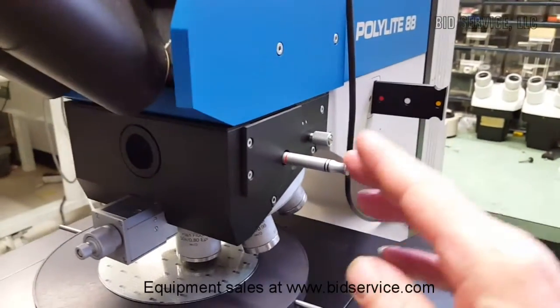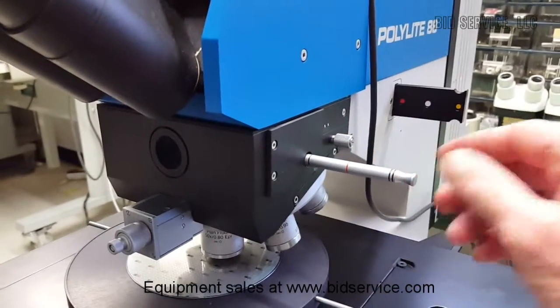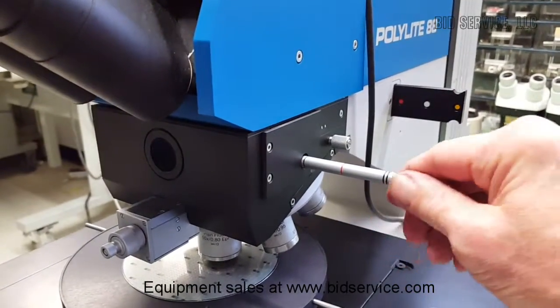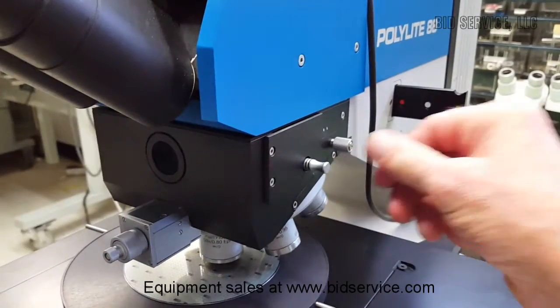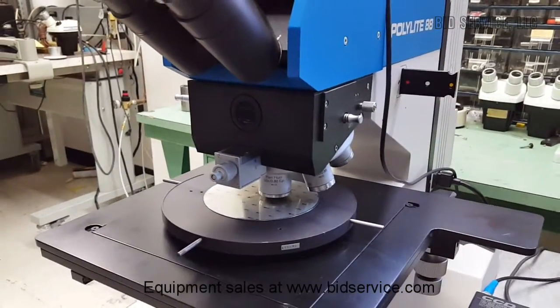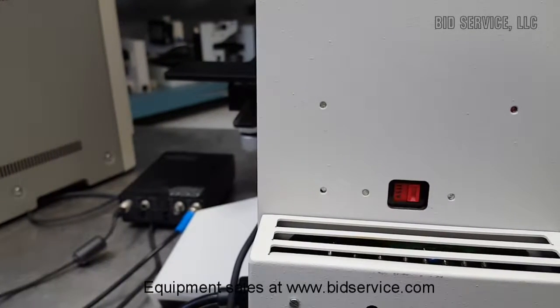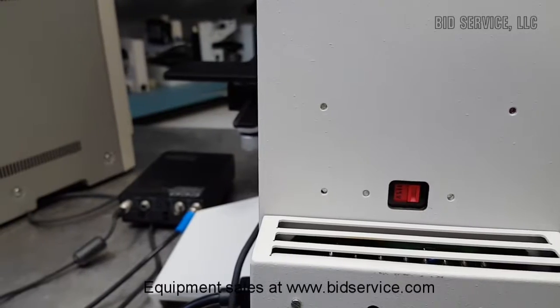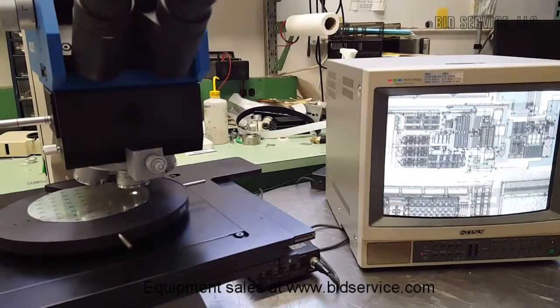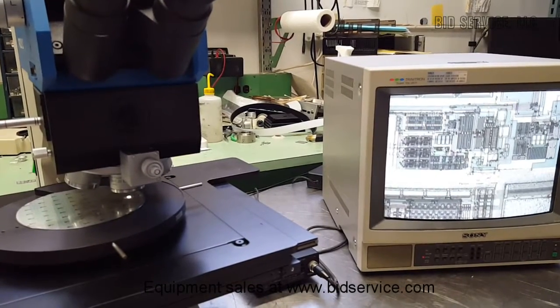Here's the other slide with dark field, bright field, and Nomarski options. On the rear there is a 115/230 volt switch. I'm going to move the stage back and forth — it stays in focus pretty well.